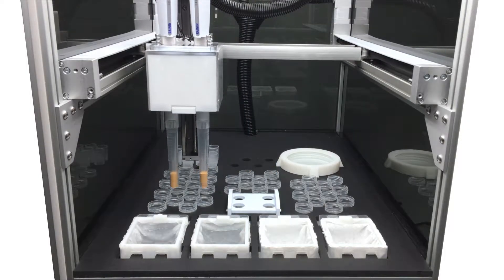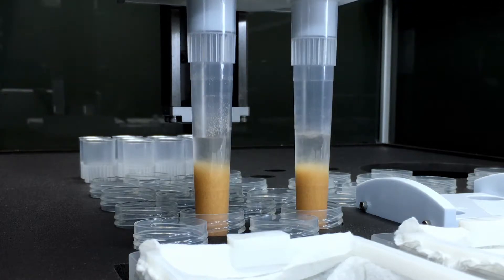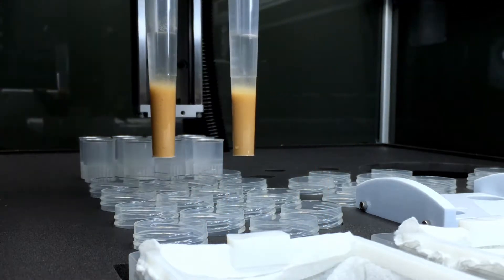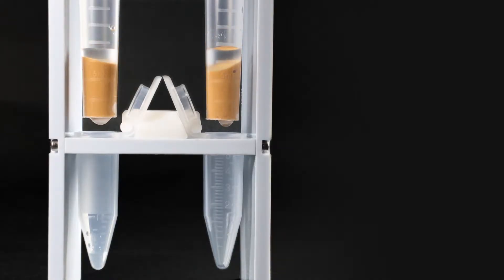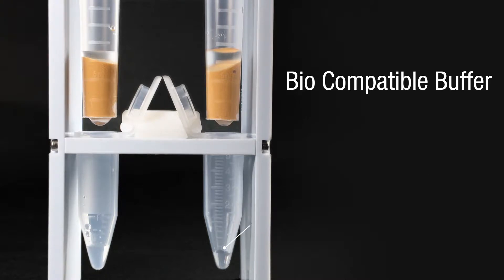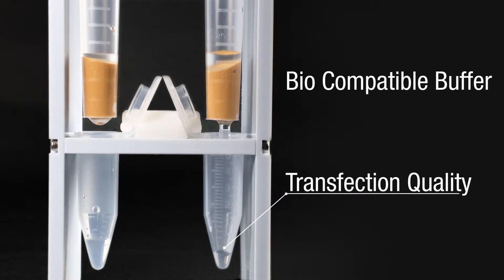Based on Phynexus dual flow chromatography technology, the Autoplasmid MMG process is rugged. There are no restrictions on the type of plasmid sample. Recovery of the plasmid is into a biocompatible buffer. The plasmid is transfection quality and can be used for any desired application.